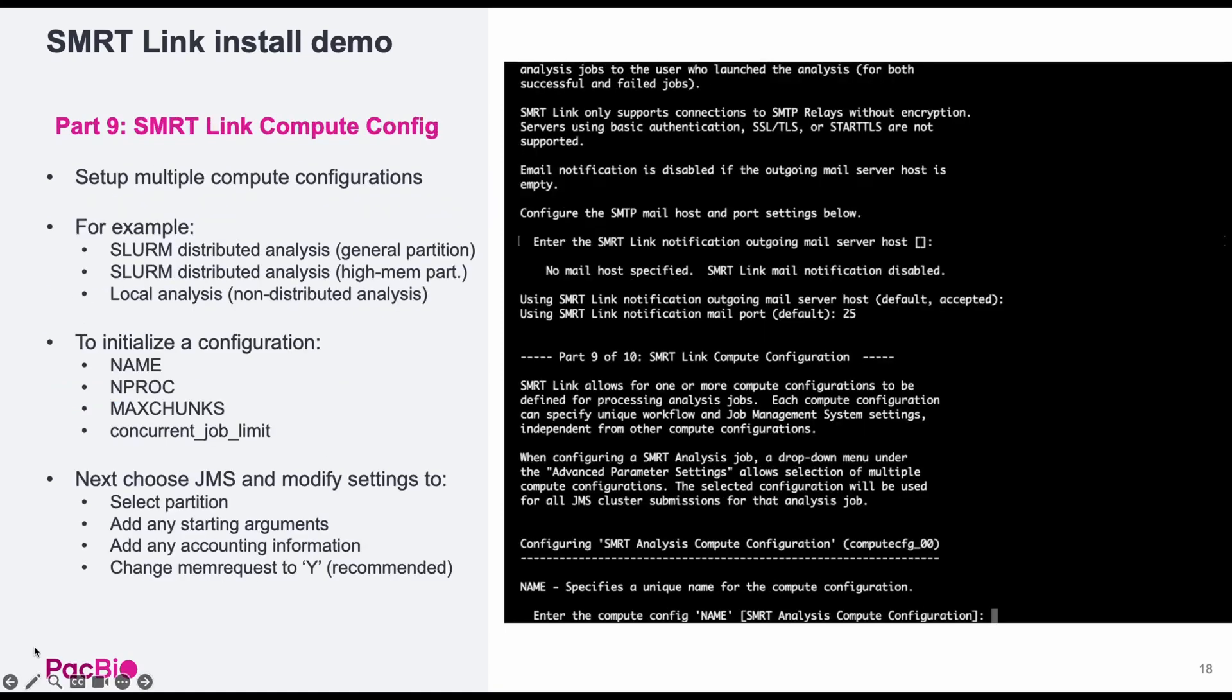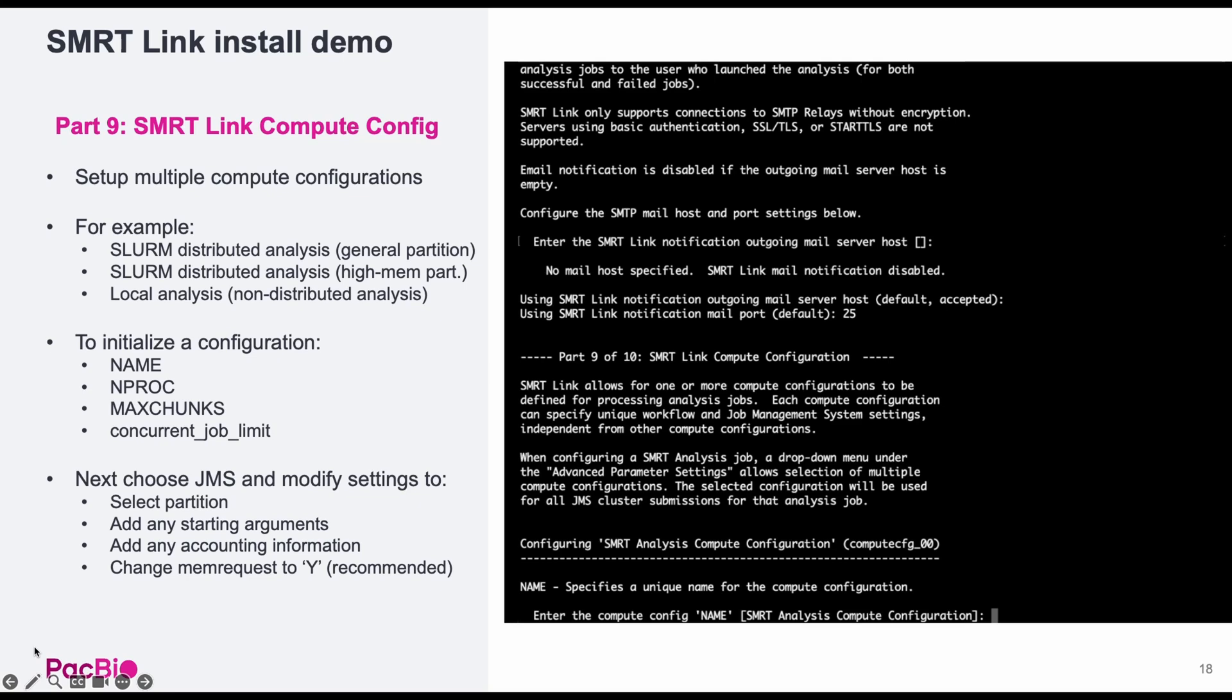Part nine is the most comprehensive step and is for setting up smart analysis compute configurations. You can set up multiple different compute configurations for submitting jobs to different partitions or locally. As an example, you can set up a configuration for a general SLURM submission, a separate configuration for a high memory partition of the HPC, and a third configuration for a local or non-distributed analysis. First is simply choosing a name for the configuration, setting the number of processors per task, chunks per file, and concurrent job limit. Here I've accepted the default.